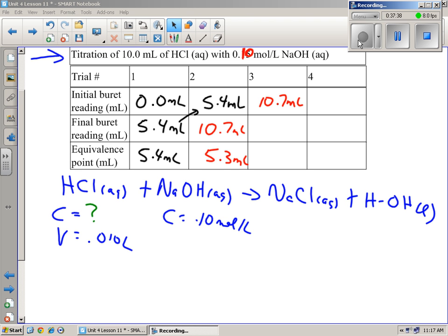Oh, I'll show you real quick. See that? Oh, just disappeared. You want the light pink color probably about 5 seconds. Okay? That's kind of what you want for as far as that color. It's kind of disappeared already, so we were pretty close on that one actually. And if you want, you could record the volume right now to see what it's at, write that down, and you could try another drop and see what happens. The only problem is, make sure that after you add that other drop, you adjust it here to start when you're starting the next one, right? If it's not your last experiment here.